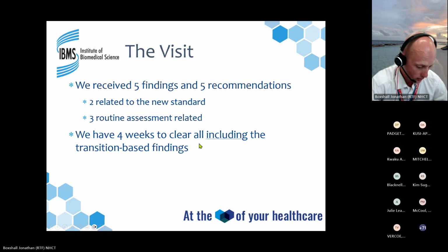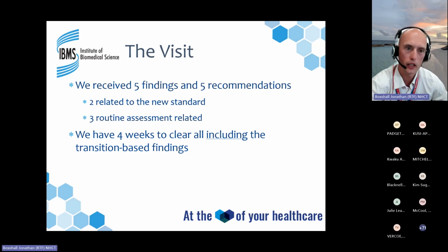So just picking up on a couple of the things that Mark had mentioned. One of the things that I've had a look at recently was audit-based risk, and looking at the audit calendar, which I'd planned out for about 4 years in advance. What I did was a review, and how I went about it for our lab is basically pulled a list of all the CAPAs or findings based on any audits, and then managed the calendar around that.